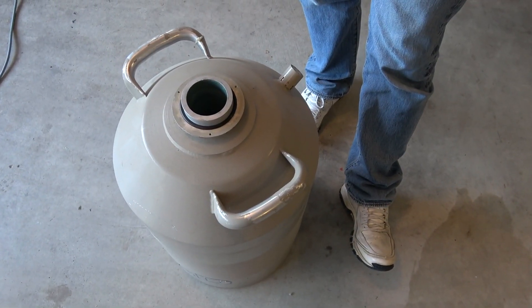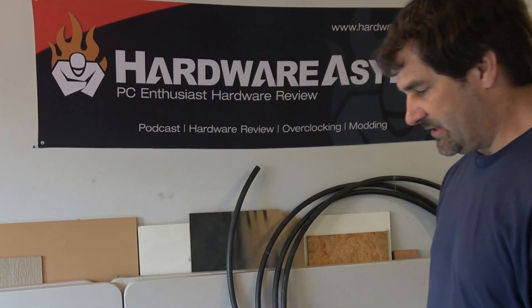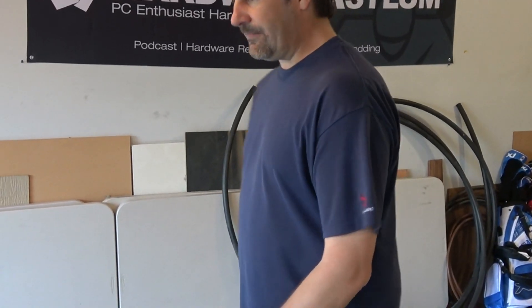We're not going to fix it. I thought we would cut it open to see what's inside. Won't it explode or something? It shouldn't. I mean, it's got a vacuum. So wouldn't it implode? Yeah, it might implode. But I think what we're going to do is just slice here and slice there, and we'll see what's inside — we'll do it for science.